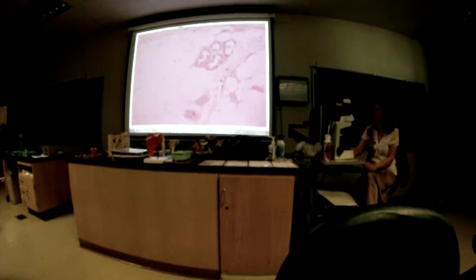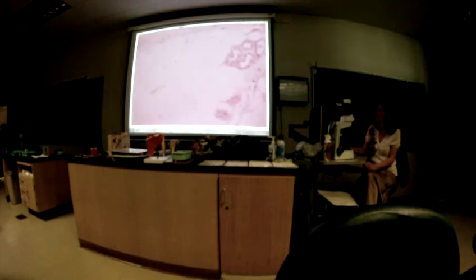And so what main layer are we in here? Cutaneous. Subcutaneous. Not the tissue type. Reticular. But the hypodermis. Hypodermis. And that's when you get a shot, that's the layer that they usually put in. Is the sweat gland always in the hypodermis? Not necessarily. No, these ones can be in the deeper layers of the dermis or in the hypodermis. The other types are usually a little more superficial.